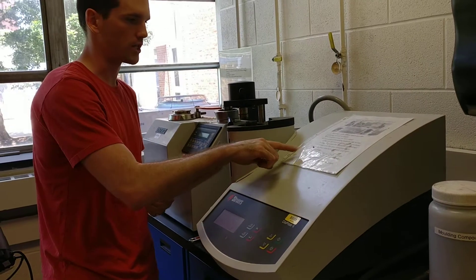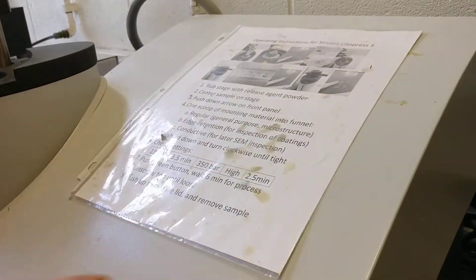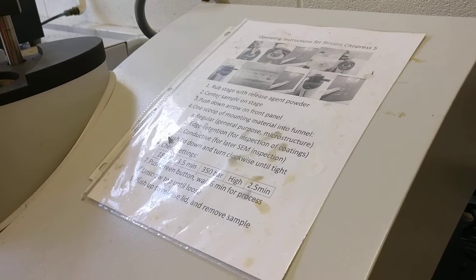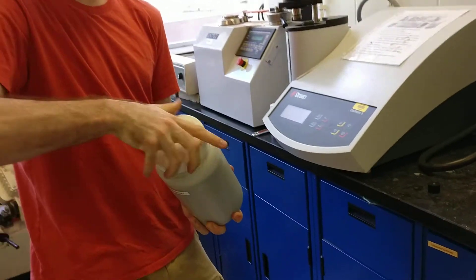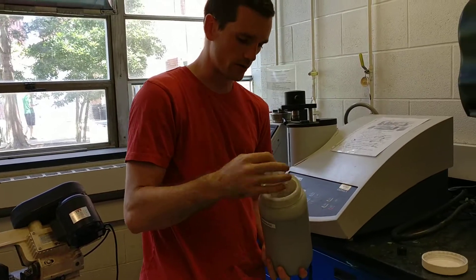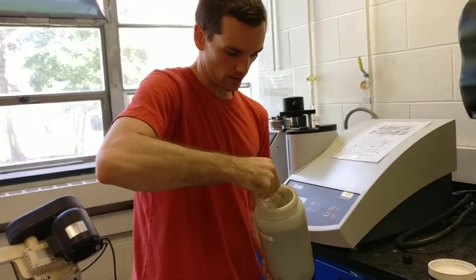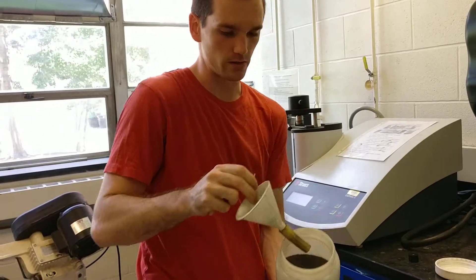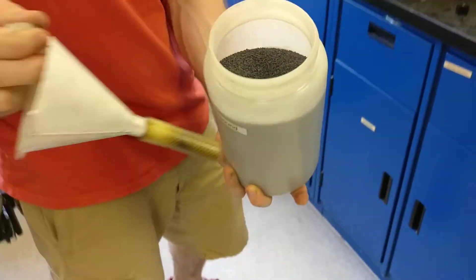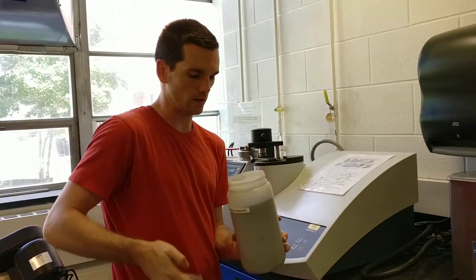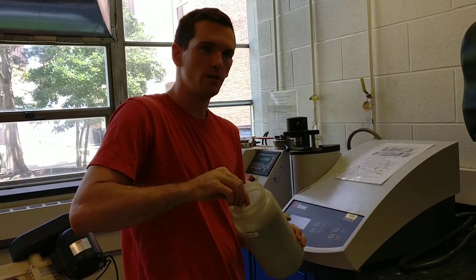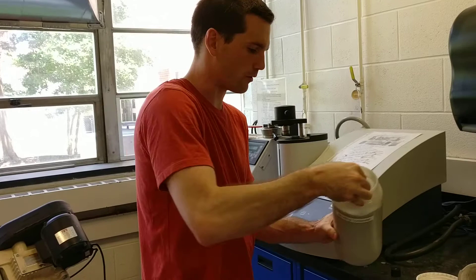You want to check the settings here. These are set for our mounting material. So this is just bakelite, also known as phenolic resin. It essentially is these little rocks with some powder in there, and that's a thermoset material. So once it applies some heat and pressure, it will flow around the piece.